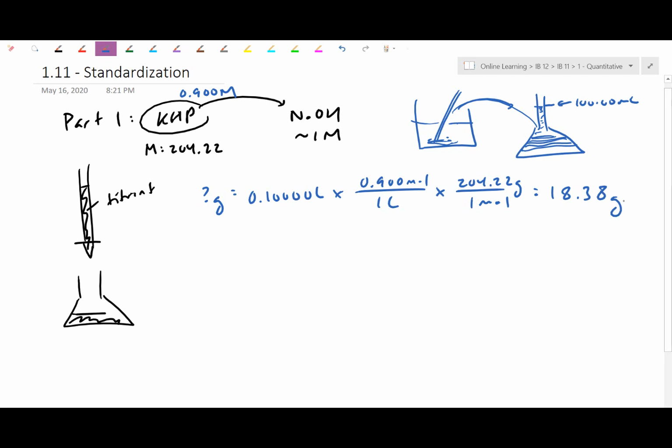If you just follow the sig figs from there, you would say, well, I'm limited by the precision of this. But remember, we are actually making the solution. So it's actually depending on the precision of the other numbers. My volumetric flask here had a lot of precision. Our molar mass here has 5 digits. If my scale gives me 4 sig figs, that will actually help me get the concentration to 4 sig figs. So that's actually a good thing here.